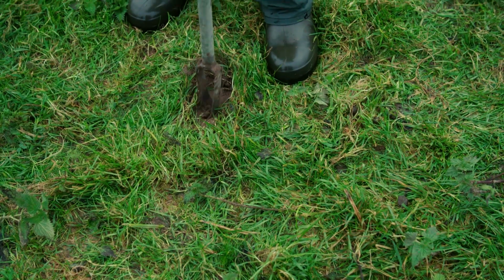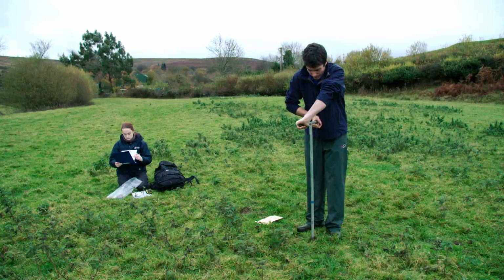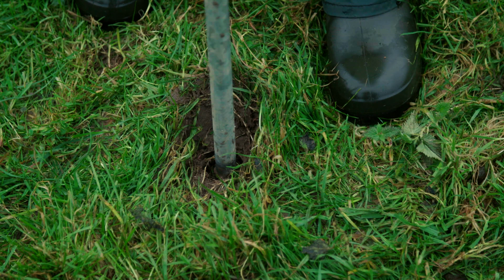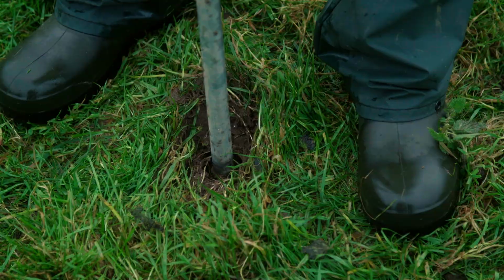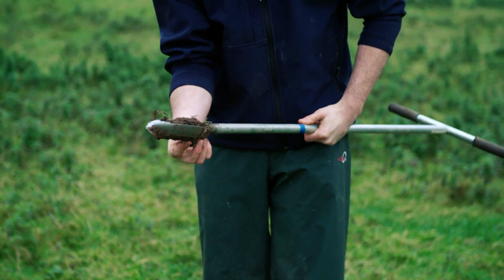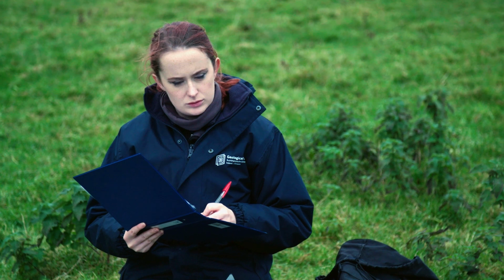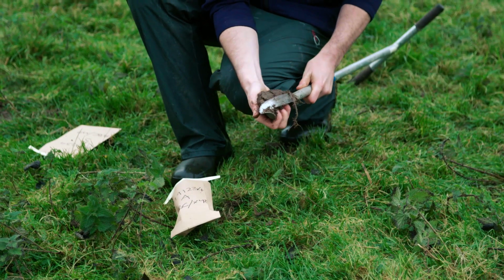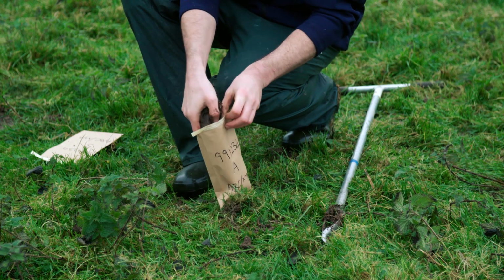The first sample is collected from the top layer of soil to a nominal depth of 20 centimeters. Ensure the auger is upright and your back is kept straight. Use a pushing and clockwise rotating motion until the top of the auger flight is level with the ground surface. Remove the auger and take note of the sample characteristics. These include colour, texture, water and organic content, clast lithology and the presence of any contaminants. Describe the characteristics to your partner and note these observations. Place the sample in the bag labelled A.